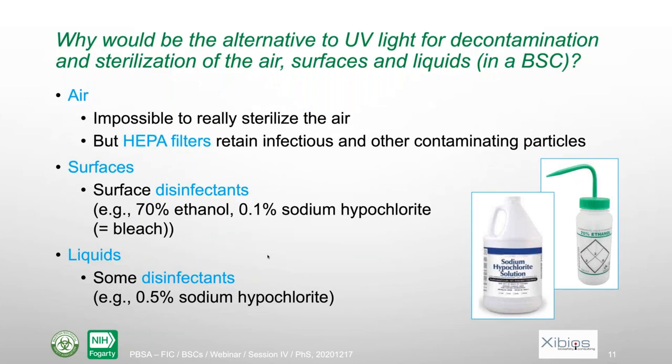Another question was what would be the alternative to UV light for decontamination and sterilization of the air, surfaces and liquids in a biosafety cabinet? Actually, for the air, it's impossible to sterilize the air. UV light will not sterilize the air. It will only work on surfaces, but not on the air, because it moves too quickly. So there is not enough exposure time.